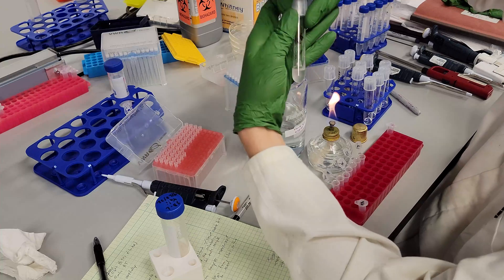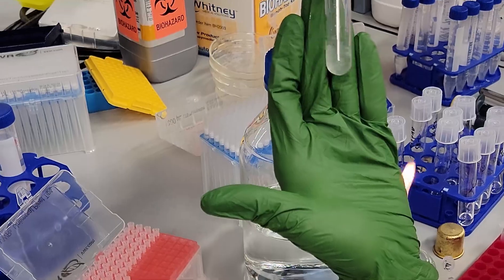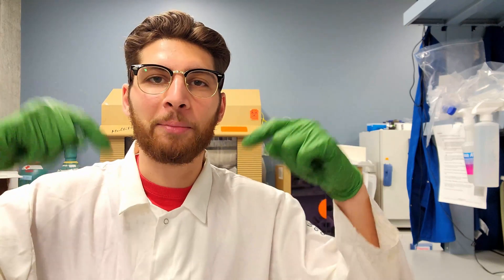I take a mental note of how turbid the solution is here. This tube needs to grow for 2 to 4 days to reach confluency. Once the liquid culture is mostly opaque, I do a 10⁻⁴ or 10⁻⁵ dilution and plate. I use selective plates if I want to maintain the plasmid, and YPD plates if I'm doing a CRISPR knockout or integration. Then I follow up with colony PCR to confirm transformations or integrations. This is a really simple transformation protocol with super high efficiency. Check out the comments and description for more details. If you have tips for working with YALI, or if you have questions, leave them in the comments below.